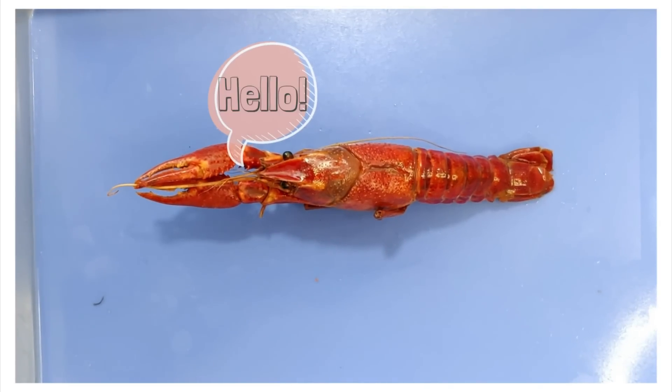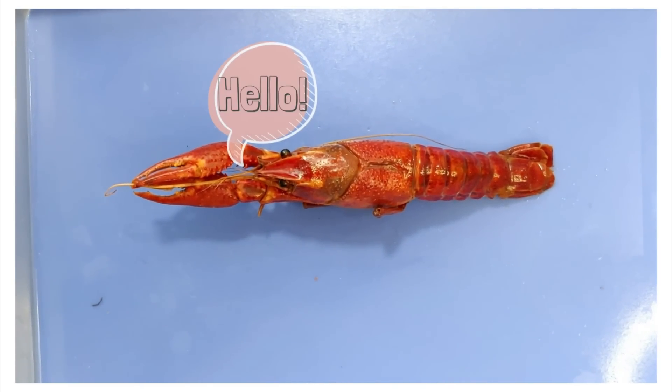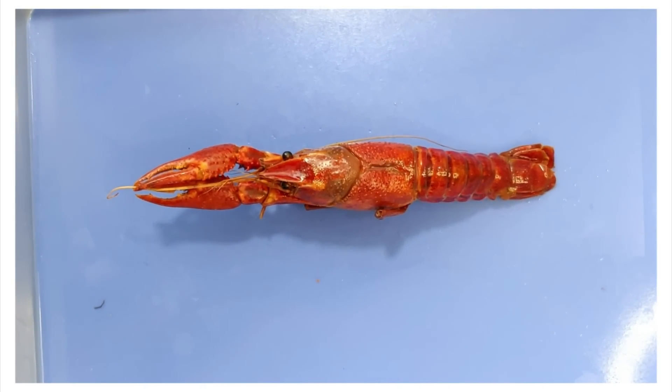Hello and welcome to O-Wyrm. Today we'll be looking at the anatomy of a crayfish.